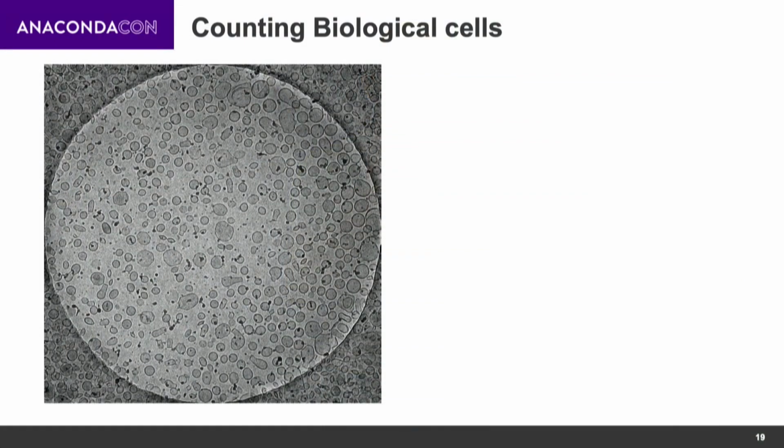So when we started working with the client, we wanted to see what approach would work here. At the outset, though, it looks very different, but it has similar characteristics of a crowd counting problem. So here again, you have those density clusters, certain portions crowding out the cells. And then there is a challenge of occlusion. There are some cells which overlap and come in front of the other one. And so on. There are these images which have low light, dark light. You'll have to do some contrast improvement.